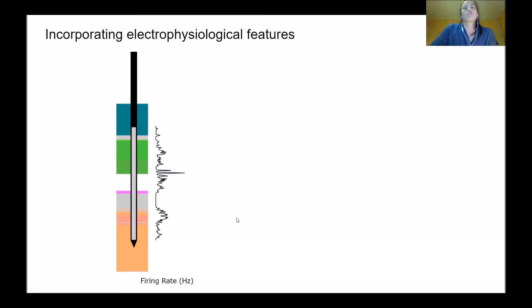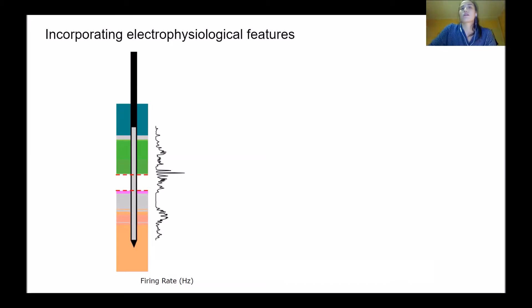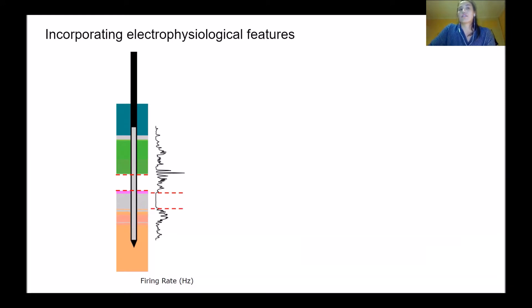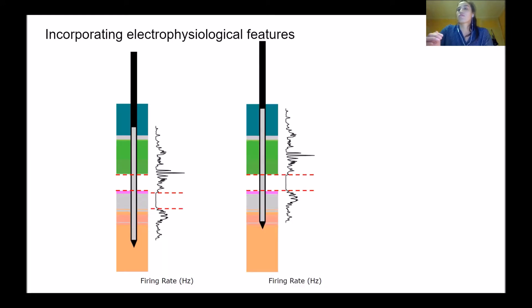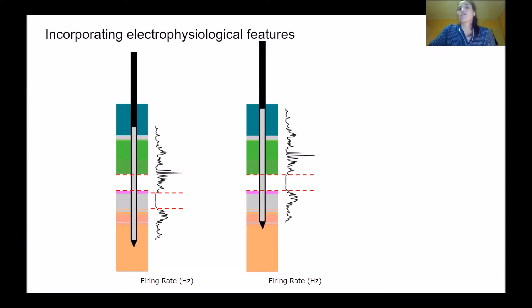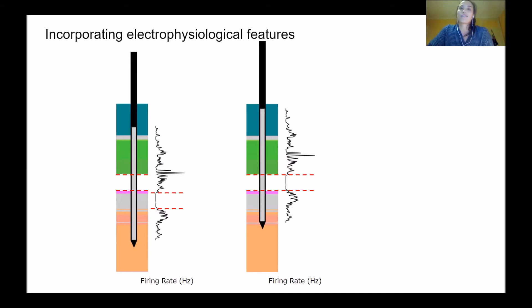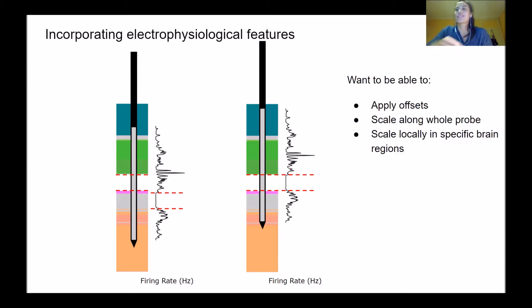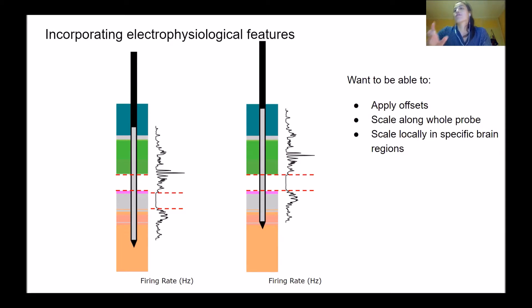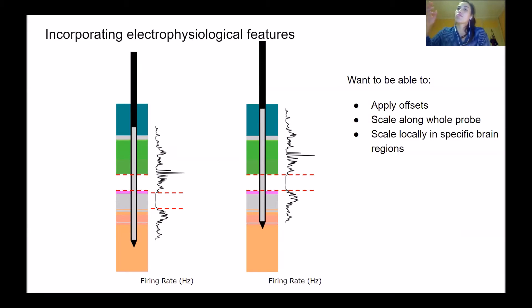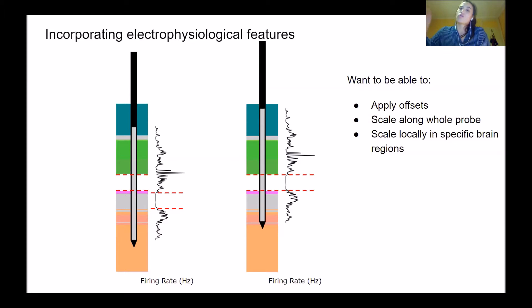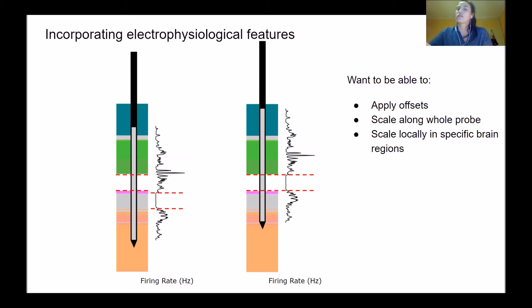What we can do is use reference lines, where we place them both on the histology image and on our electrophysiology feature, and then use these to shift our electrodes in the brain and relocate their position and coordinates. This shows a very idealistic case where we've just applied an offset. But in reality, we want to scale the distance between electrodes along the probe, both in total and in specific brain regions that have been warped or scaled more than others.